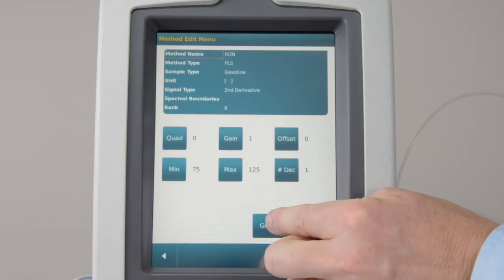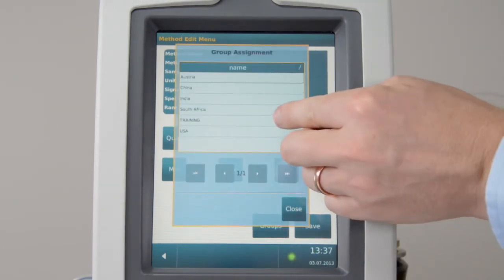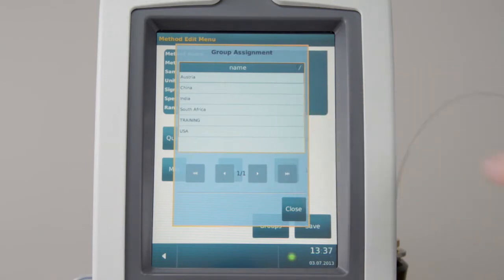If you go to Groups, you will see which fuel groups are currently used for prediction.